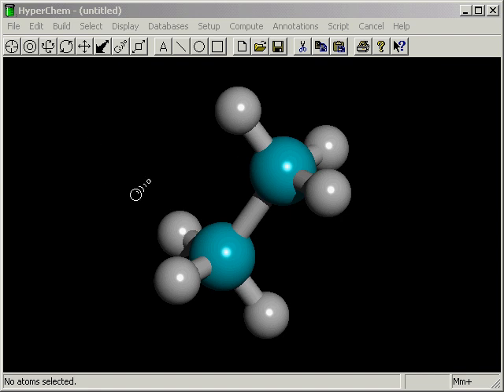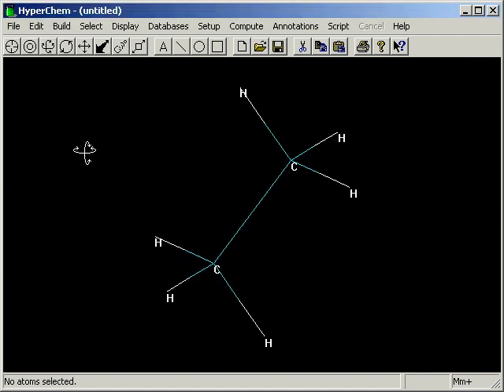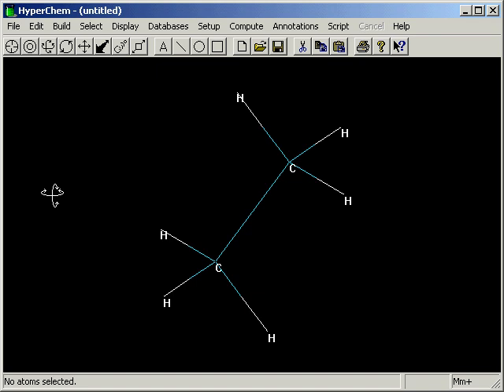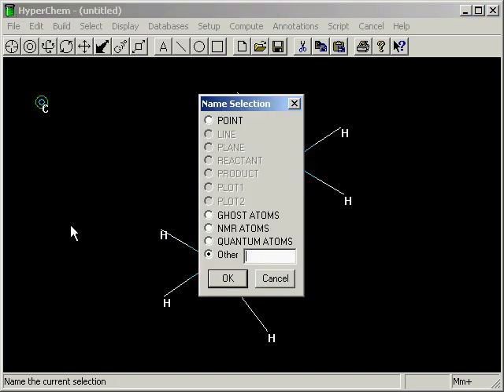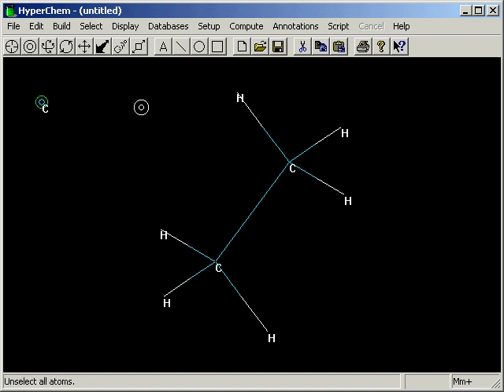However, it is possible to customize this by having your own light sources. Now, when you rotate an image or anything, these are not persistent. The image just disappears. And the way to add light sources is to just add other atoms, like this carbon atom here, and to give it a specific name. So if we name this LIGHT something or other, 234 HHH, something that starts with light, it'll be a light source.